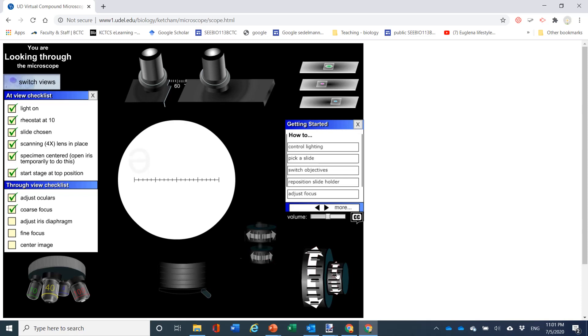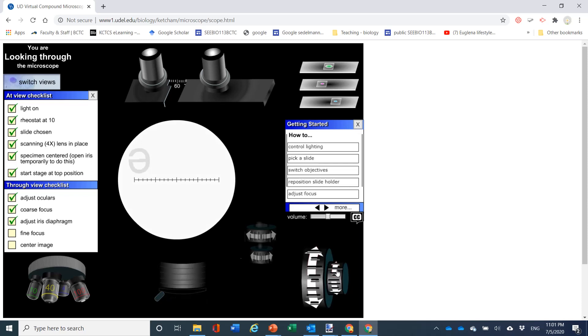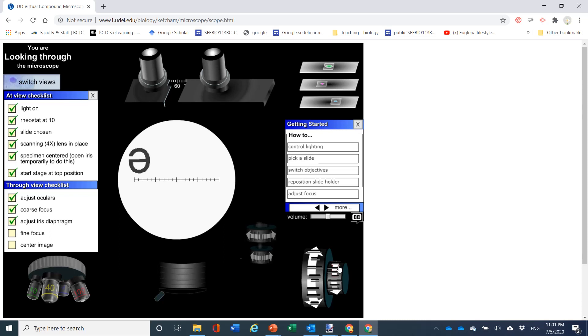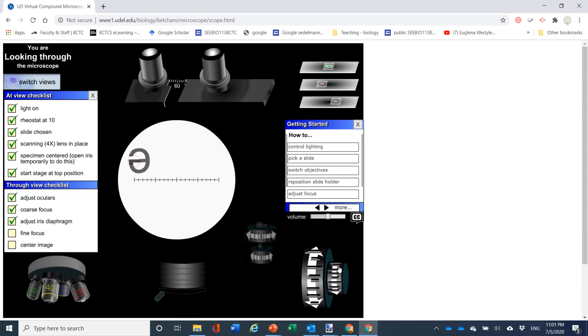And now you want to adjust the iris diaphragm to get up the contrast. And this particular microscope, virtual microscope, gives you a red circle that tells you. And I had an old camera that used to do that. If the red circle matched, it's like two overlapping things and if they matched you were good.